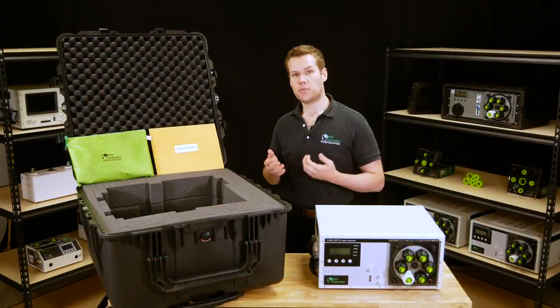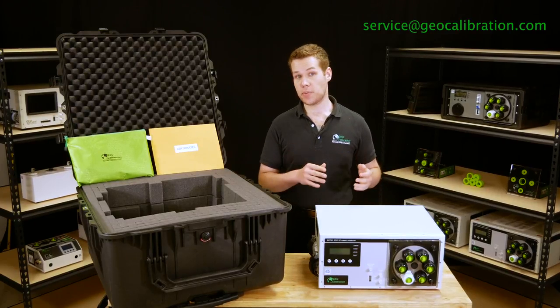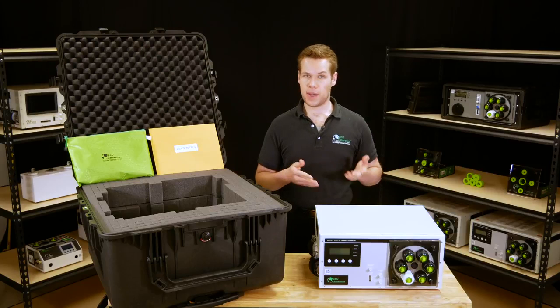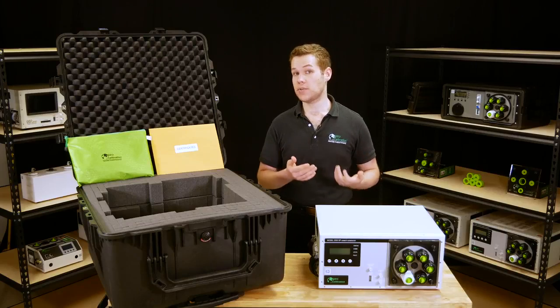If you see anything at all wrong with the unit, immediately email service at geocalibration.com with both a description and photos. Assuming the unit passes your initial inspection, you should check the green bag to make sure you have received all of the following items in your accessories kit.